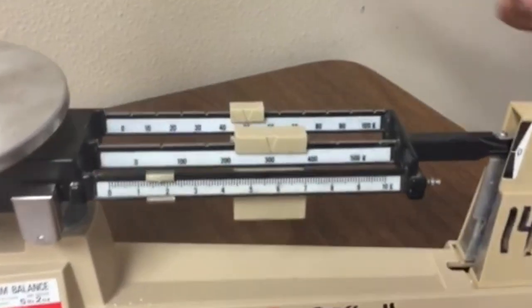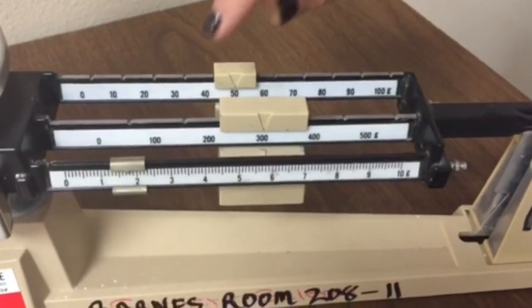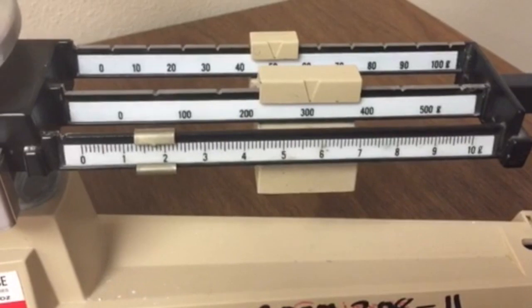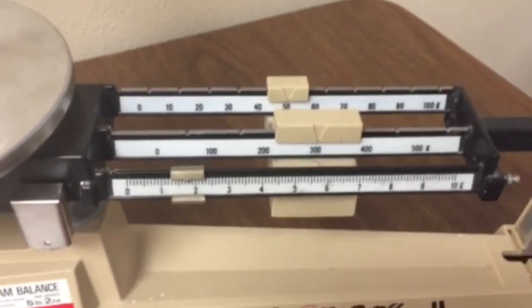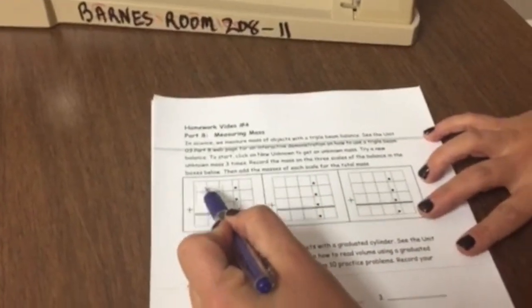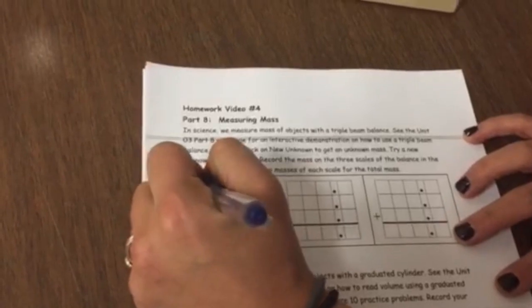So when I read this, I'm going to read it as 351 and seven tenths. When I write that on my paper, I'm going to use this top for my hundreds. So I'm going to write 300.